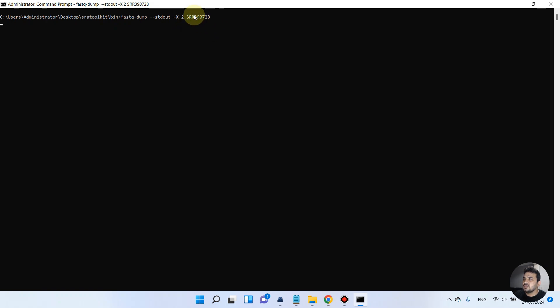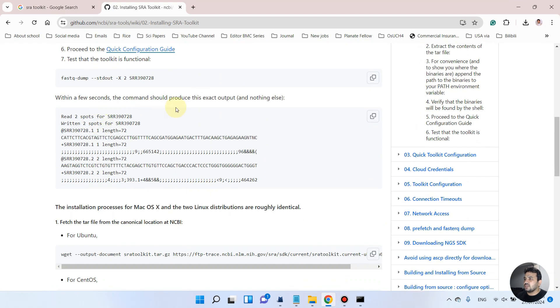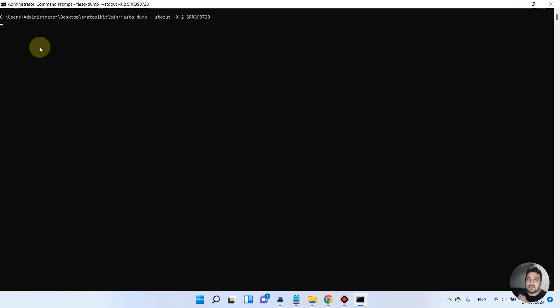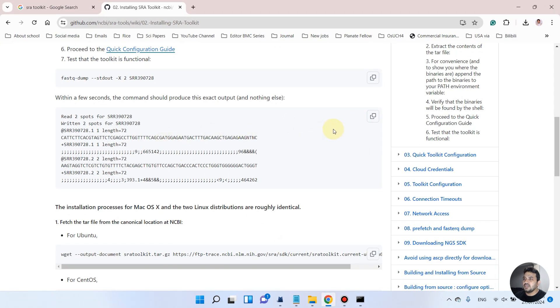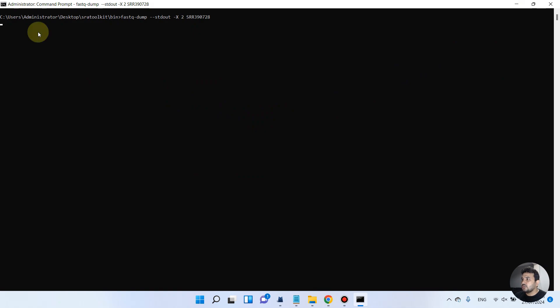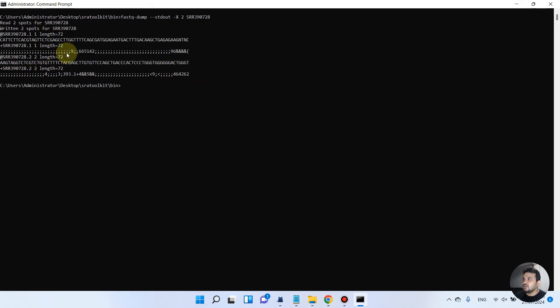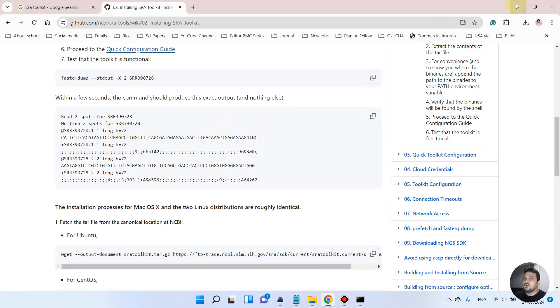Now we are going to test whether SRA Toolkit is working. After pressing enter, accession SRR390728 appears with no errors, which means the command prompt is working. Depending on your internet speed and machine RAM it may take up to a minute. Let's wait for the exact output mentioned in the documentation.